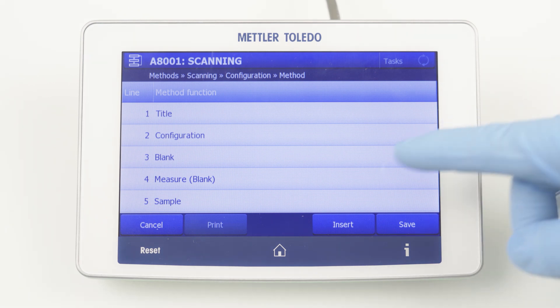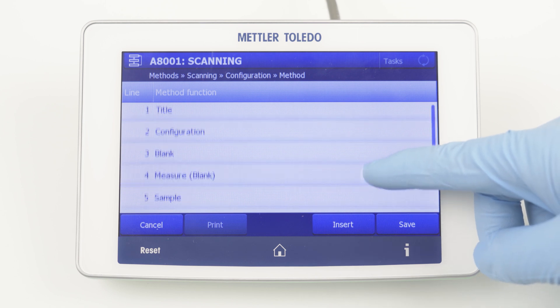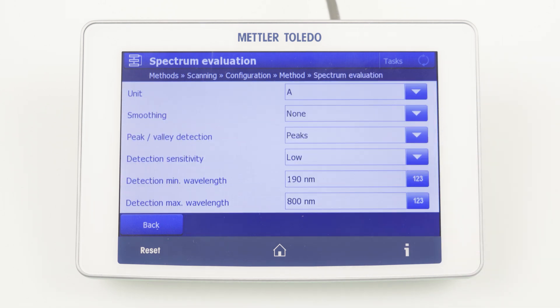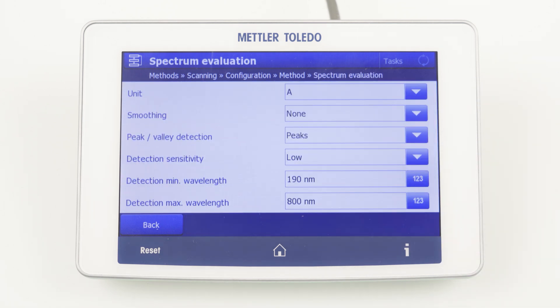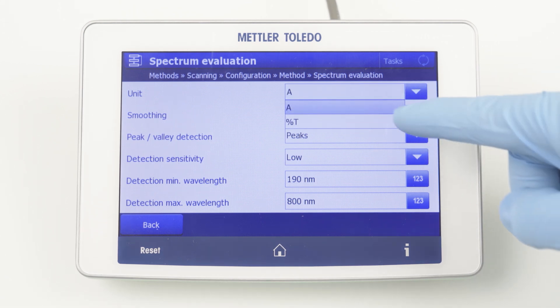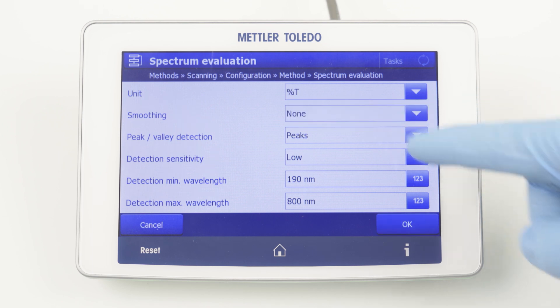Under Spectrum Evaluation, you can select the unit of the measured spectrum and some further post-processing options like smoothing and peak finding. As the yellowness index is based on the transmittance spectrum, you change the unit to %T.